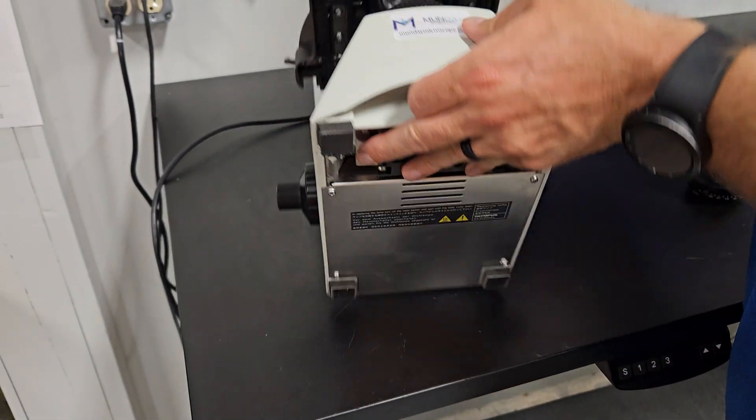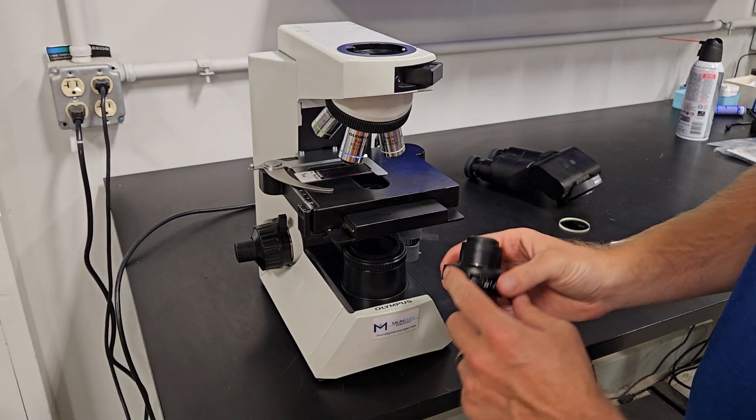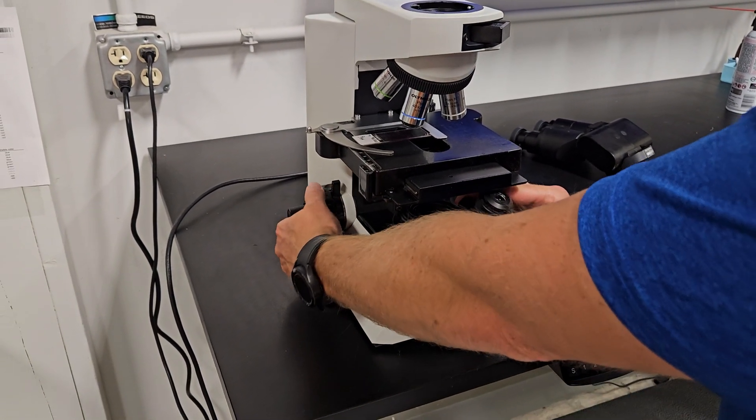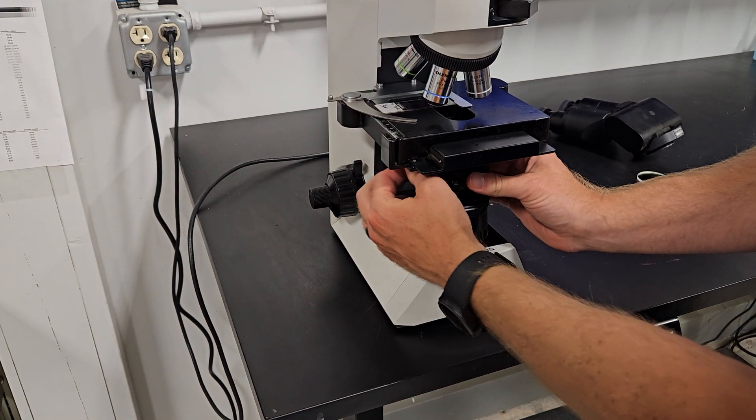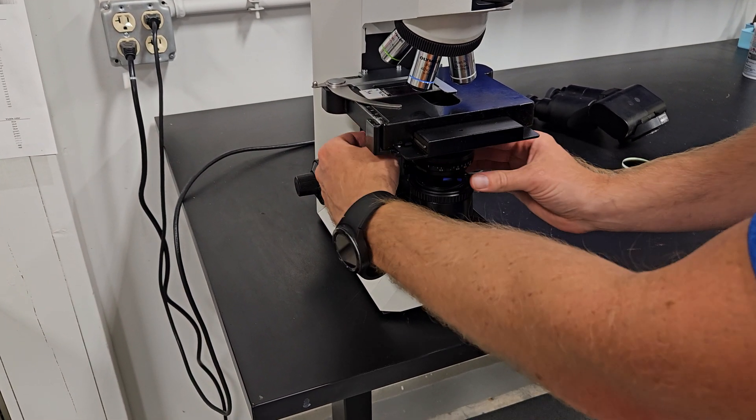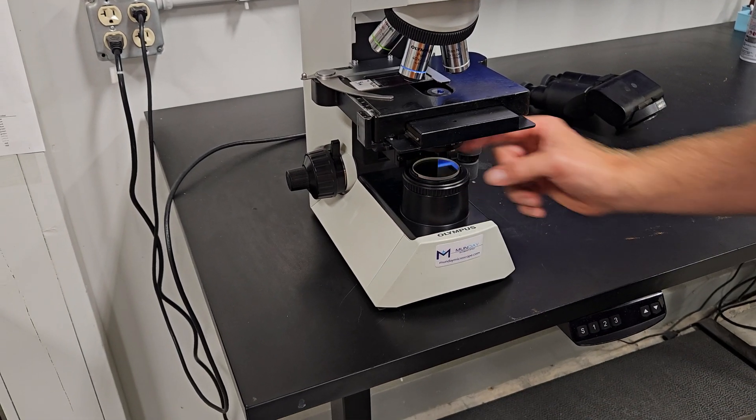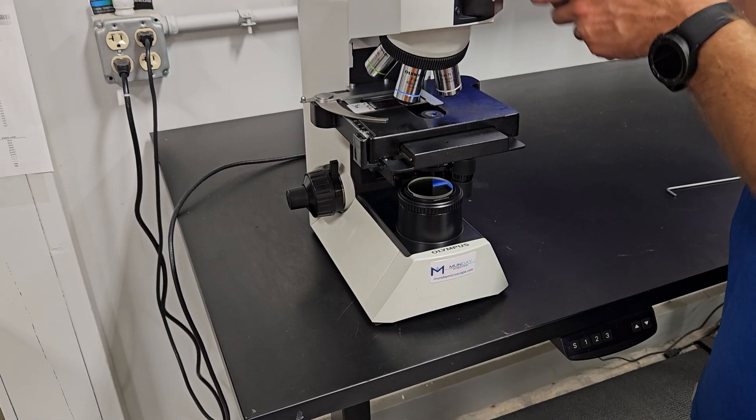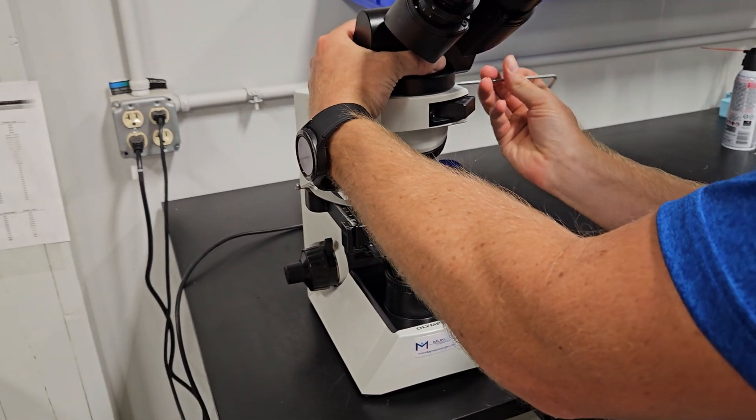We're going to put the scope back together just to help for whenever you receive it. The condenser may be out. We're going to slide it up in there, tighten that screw, raise the condenser to the top position. We're going to put the filter back on and then the head. Very simple. This is a nice little microscope.